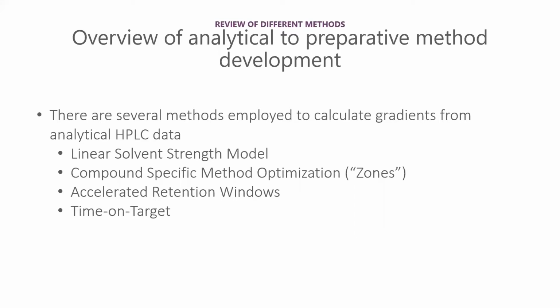All of the techniques work best with matching analytical and preparative columns to maintain the same selectivity, as we will show later. All of the techniques need matching solvent systems between the analytical and preparative runs.